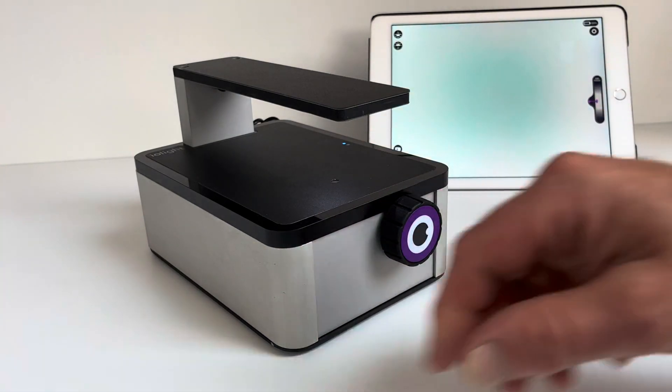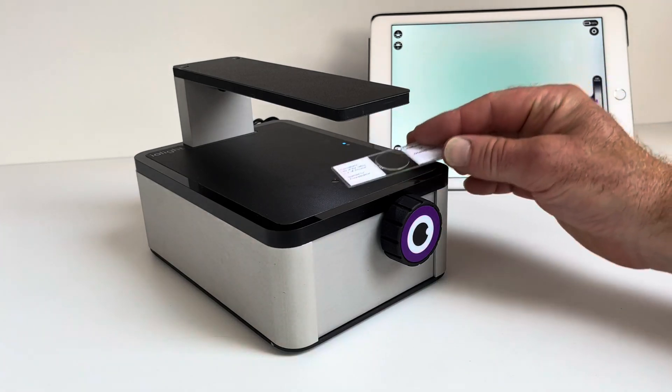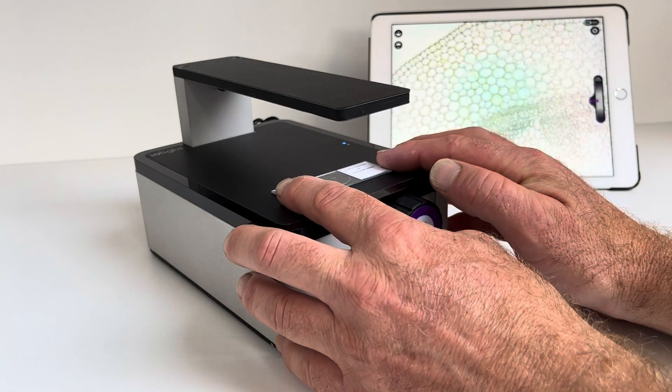That's running in bright field mode now. I'm going to put on this slide here, which is a cross section of a plant stem.